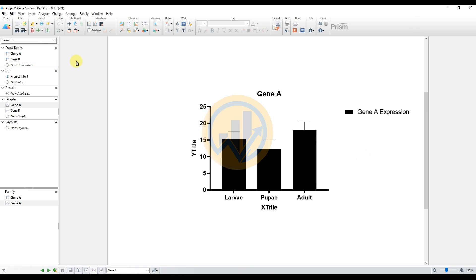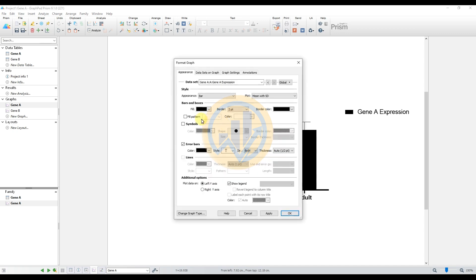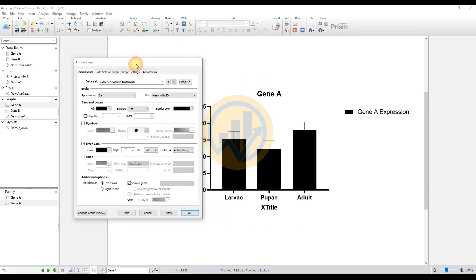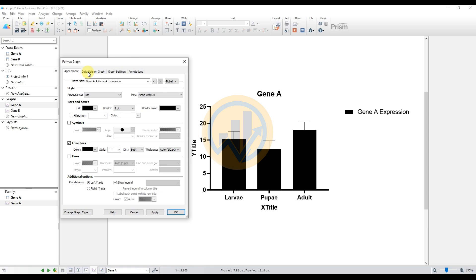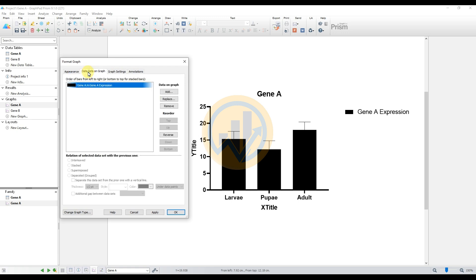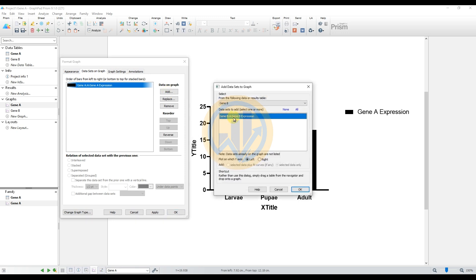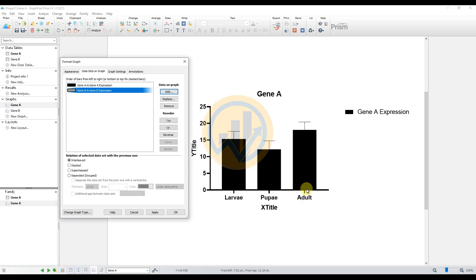Double-click the graph to open the Format Graph options. Go to the 'Data Sets on Graph' section and click the Add button. Select Gene B — the new sheet with Gene B expression data — then click OK. Select the 'Superimposed' option and click Apply.